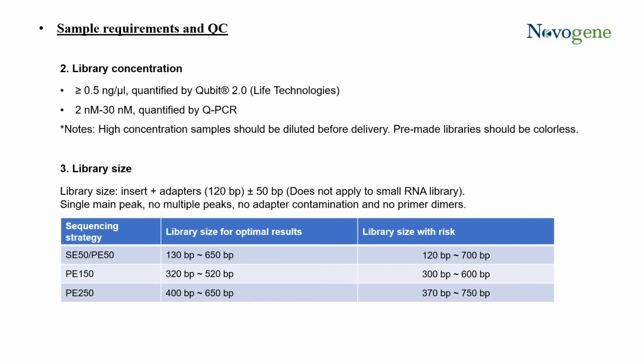And you flop your arm down, and the library reaches over and can potentially interrupt cluster generation or sequence biosynthesis of another library. So it causes physical disruption to libraries near it, which can skew your data output and also give less confidence in the read quality associated with it. So the Phred score can be affected.